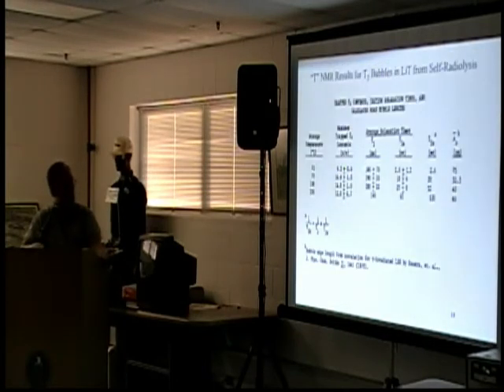And next, what we did is we took the storage temperature from room temperature up to 200, and we measured the total amount of concentration, and then we looked at the relaxation times. The T1s were typically 300 to 400 milliseconds, and then we looked at the T2 time, that ratio. There's a correlation with the wall relaxation. This is the correlation Sowers' group did. From that, we determined that the average size of a bubble at room temperature for tritium is about 5 nanometers, increasing up to 60 nanometers at 200 degrees C. We get the same correlation in the tritides that Sowers had found in the hydrides about a decade before us. And so it gave us what was going on with the tritium.